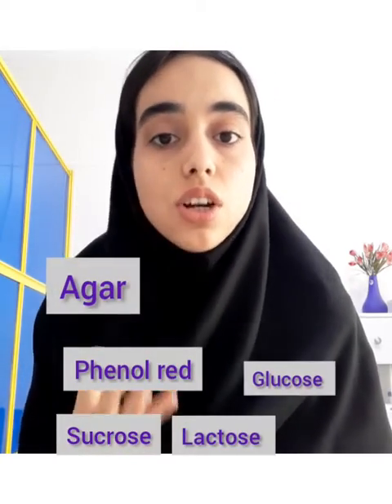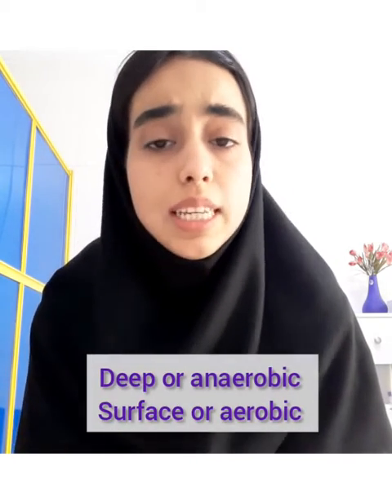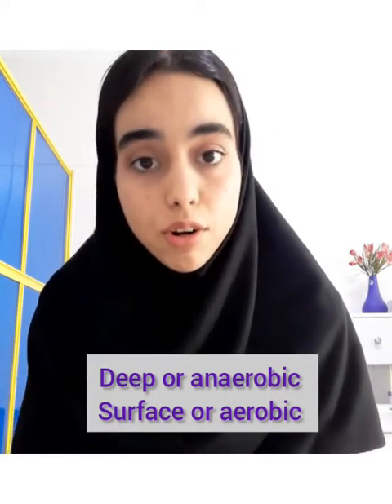The TSI slant contains agar, phenol red, saccharose, lactose, and glucose, and it's prepared diagonally in a test tube. We have two kinds of culture: deep or anaerobic culture, and surface or aerobic culture.